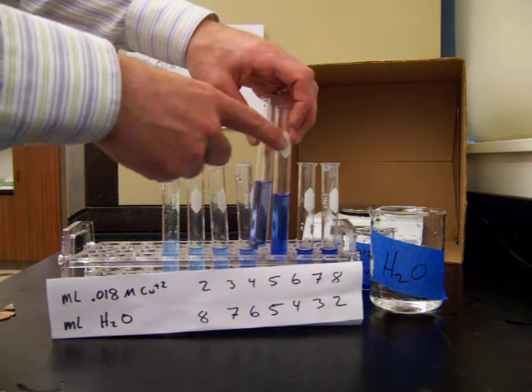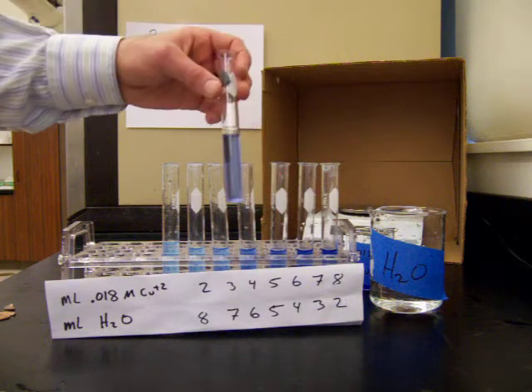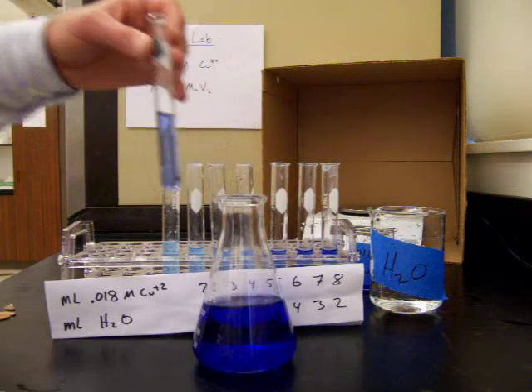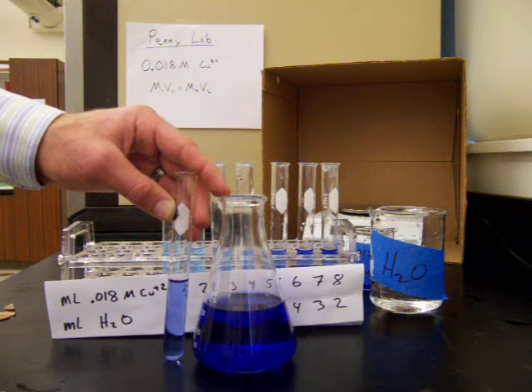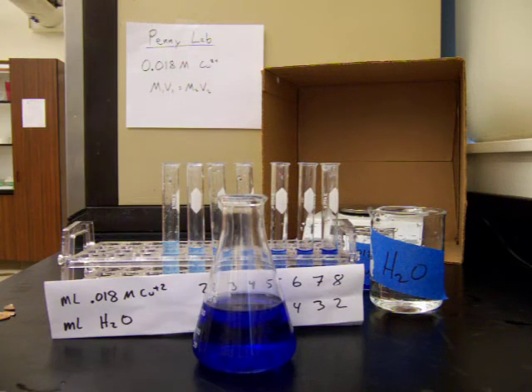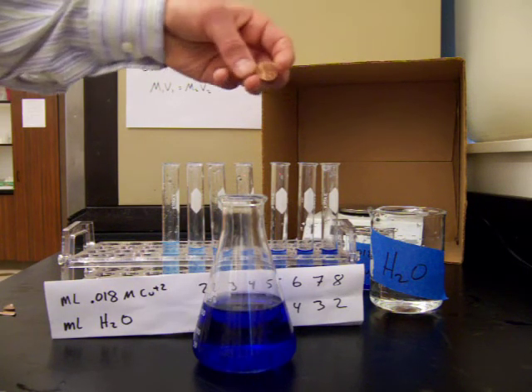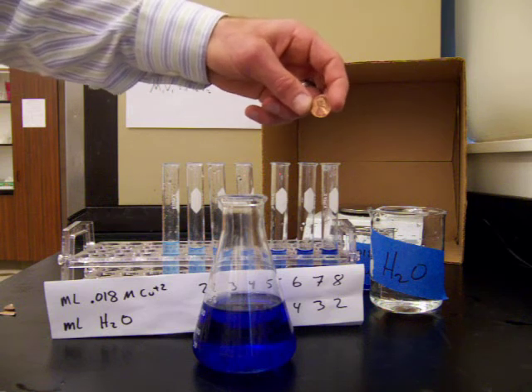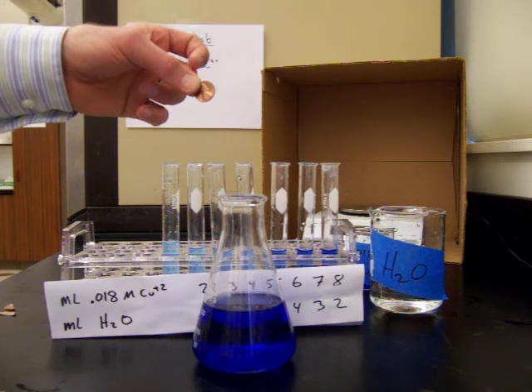We calculate the molarity of our penny solution, which closely matches the standard. Since we diluted the penny solution to a total volume of 200 milliliters, we can calculate the total number of moles of copper in the solution — and therefore in the original penny. Using a little geometry, we can then calculate the thickness of the copper plating on the surface of the penny.